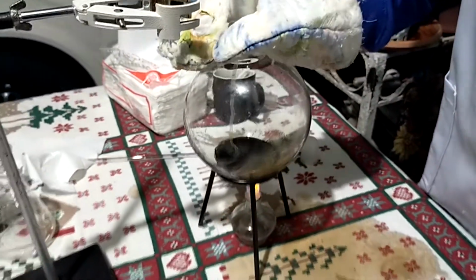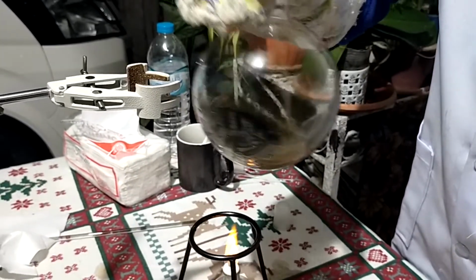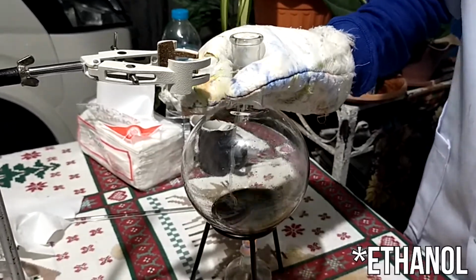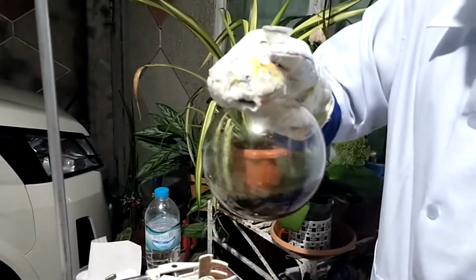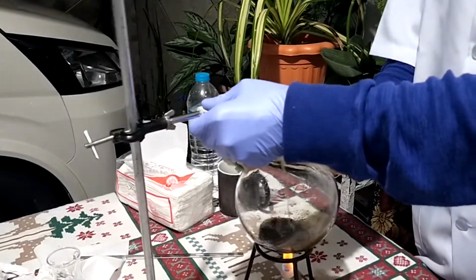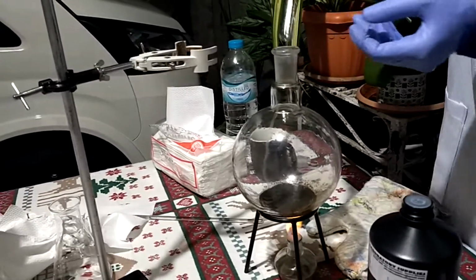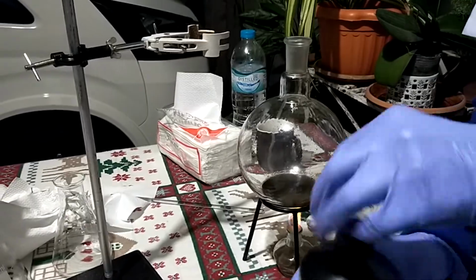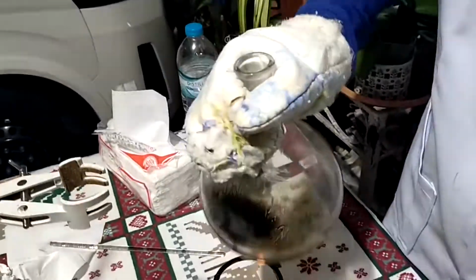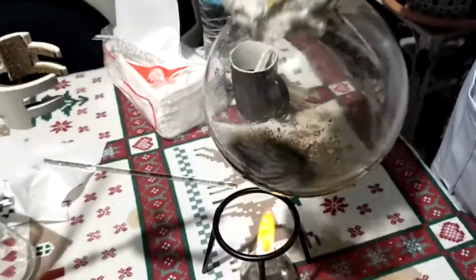This is very hot. Still, there's still caffeine on the side, so I'll maybe add another 5 milliliters. It seems that our caffeine is still here, so I'm going to add a supplementary 10 milliliters of ethanol. 10 milliliters more. So that takes it to a total of 30 milliliters of ethanol. See that the caffeine is slowly dissolving. I might add 10 more. Caffeine remaining is smaller now.